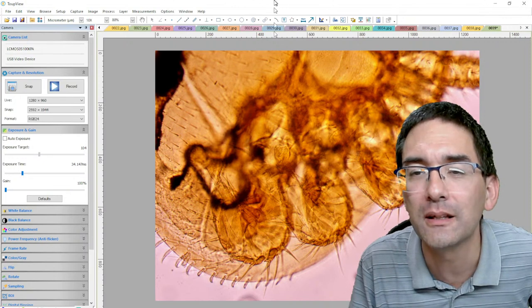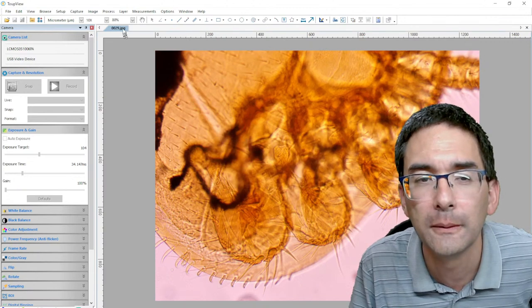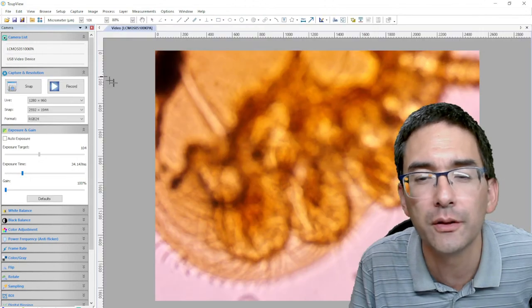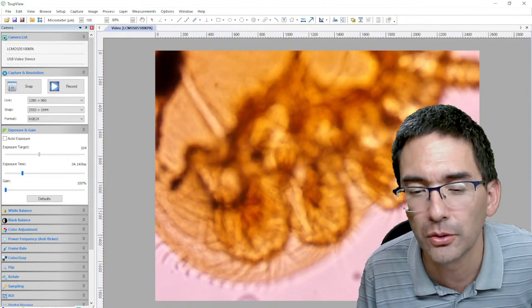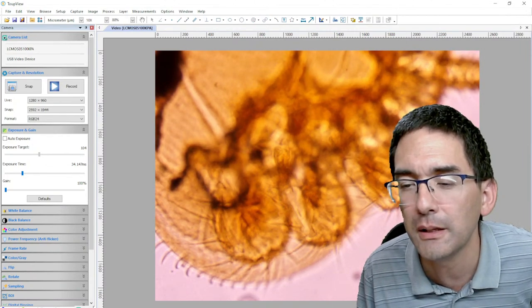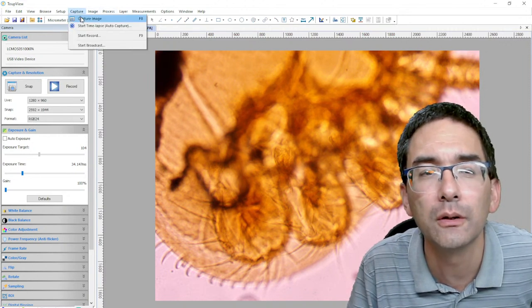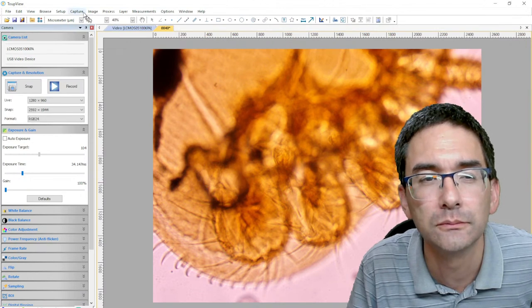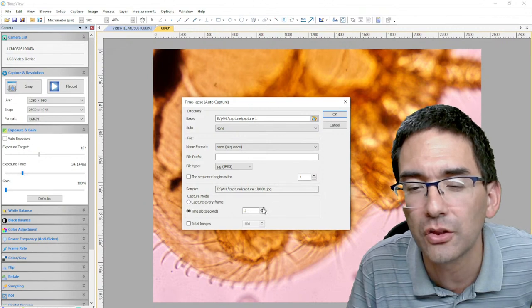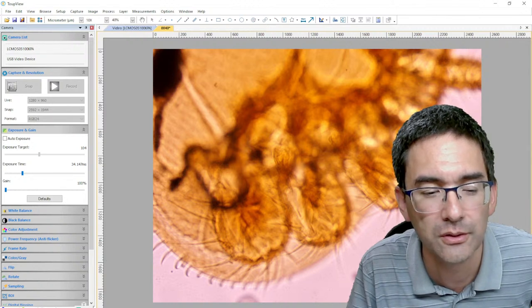So this is basically... Yeah, again, close all but this one over here. And what I will do now is I will try to turn counterclockwise. I will set the starting point and it will now maybe take a picture. Let's say capture, image capture. No, start time I have to do. I will do this, let's say, every 3 seconds. And I will start here.